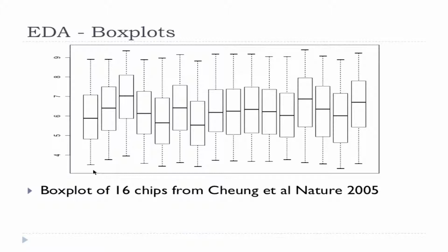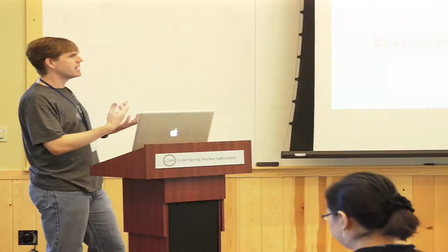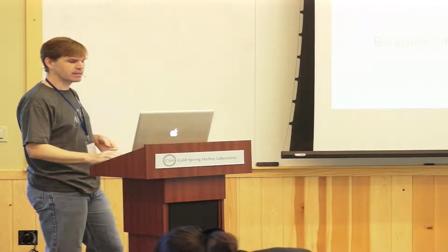Okay? That could be totally wrong. In fact, there's probably some evidence that suggests that it is wrong, but it's an assumption that we usually make with gene expression data. So we somehow need to pull these things together. That's one way of looking at the data. We somehow need to make the amount of RNA comparable across the arrays.